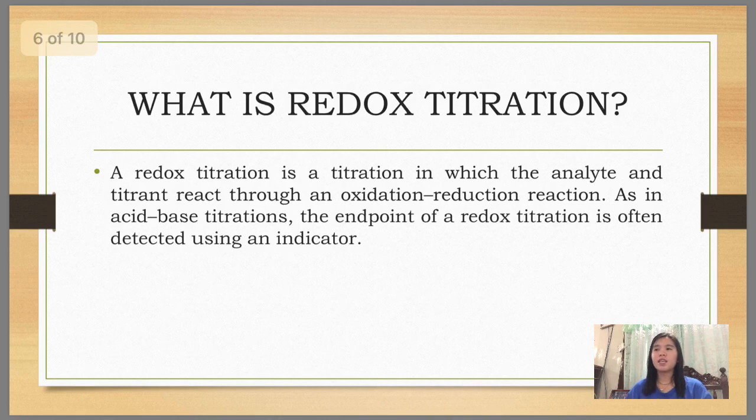And the next one is redox titration. A redox titration is a titration in which the analyte and titrant react through an oxidation-reduction reaction. As in acid-base titrations, the endpoint of a redox titration is often detected using an indicator.